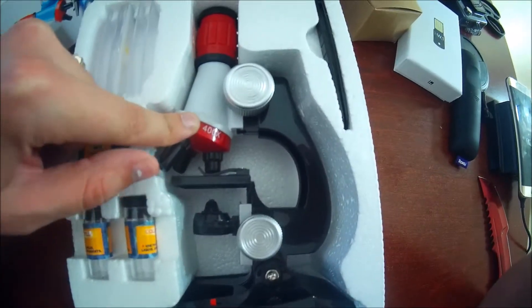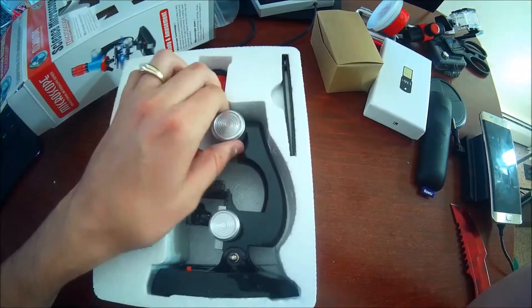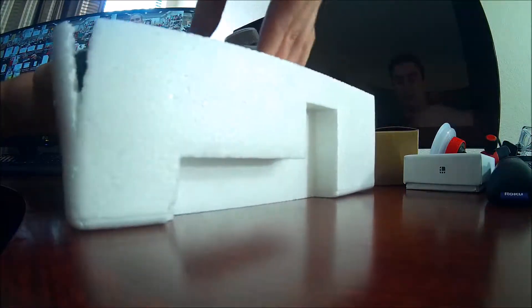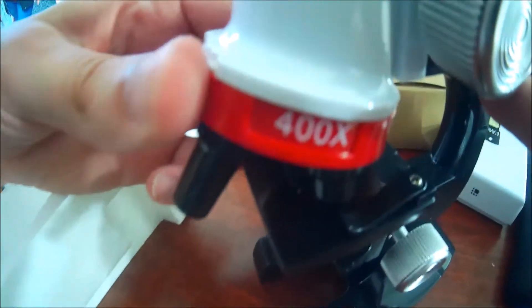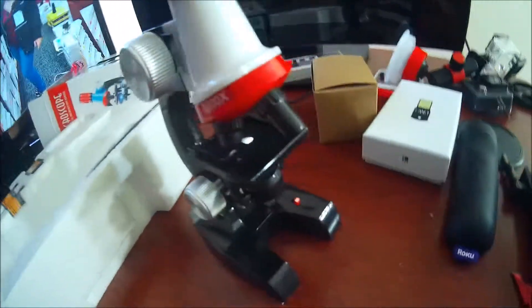I already see 400 times zoom on this rotatable zoom thingamajigger. Let's pull this out here. Not going to lie, that's not my favorite sound. So we got 100 times zoom, 400 times zoom, and 1,200 times zoom. That is incredible. That's insane.